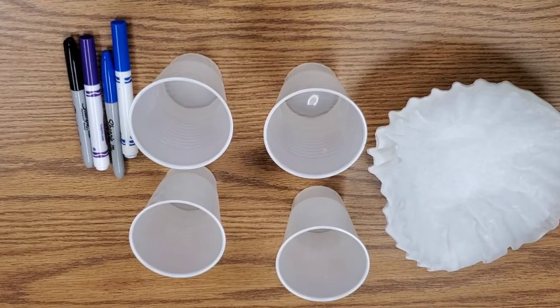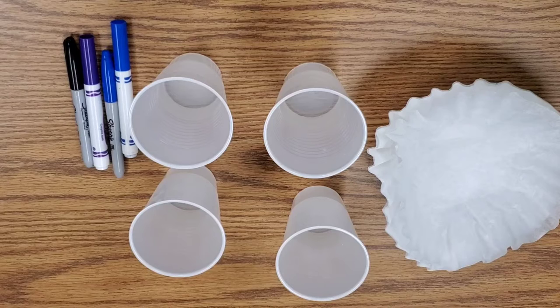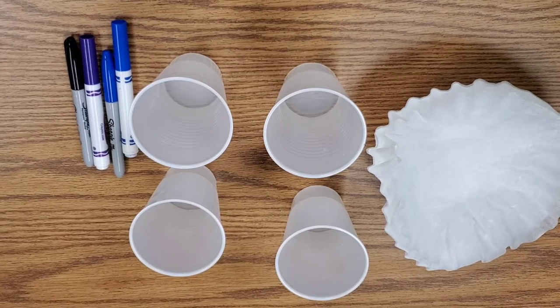Today we will be learning about chromatography. Chromatography is the separation of a mixture passing through a solution at different rates. Today we will specifically be working with paper chromatography. This is a method used to separate mixtures that uses paper and solvents like water.